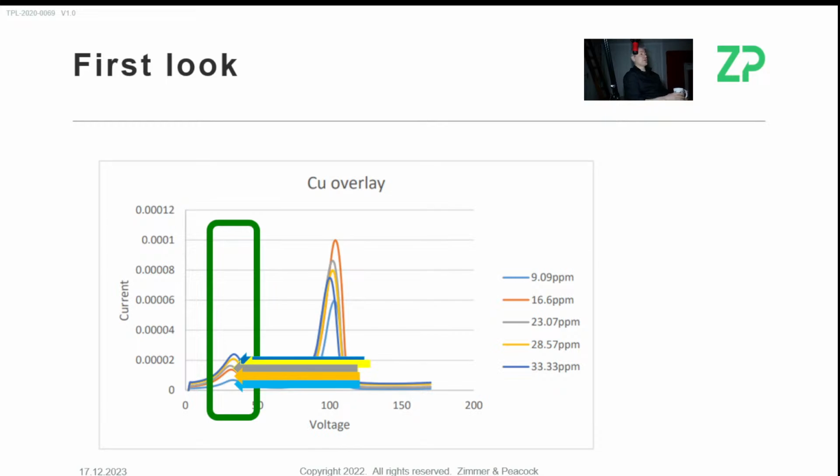As an industrial electrochemist, I'd say most of the time people are very interested in time to market; time to market is everything. So if we can just use the first peak to quantify copper, we will. It is easy to do this kind of work. For example, we have a system called Sense It All where the data goes to the cloud. In the cloud, we have a database called Julie, and we're able to say to Julie, find the first peak, find the area under the curve, use a calibration factor to turn that area into concentration, and we're done basically.